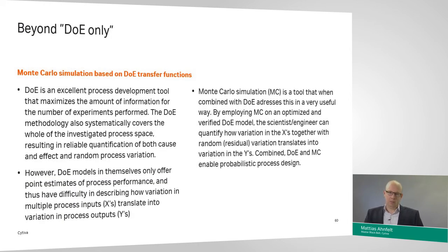So now, that was all about design of experiments, which was also the main topic of this. But I would also like to share with you a few slides about going beyond a DoE-only approach, which can be to employ Monte Carlo simulation based on DoE-based transfer functions to assess our processes for robustness.